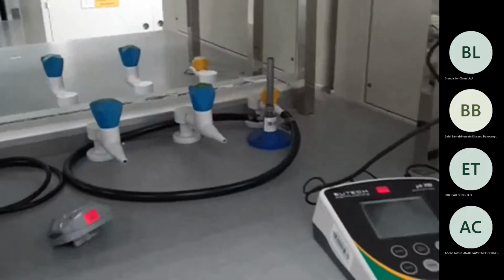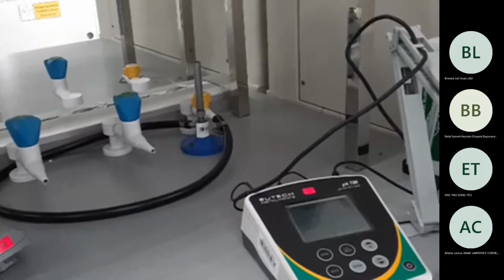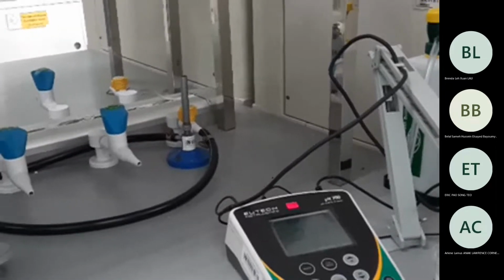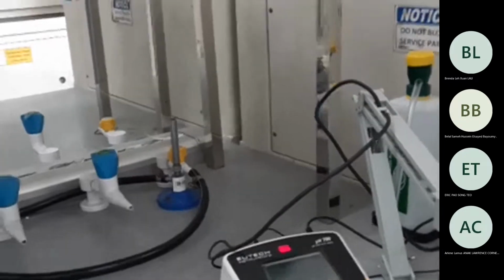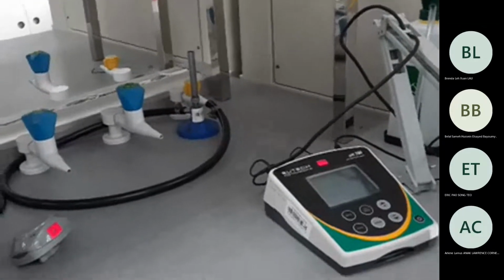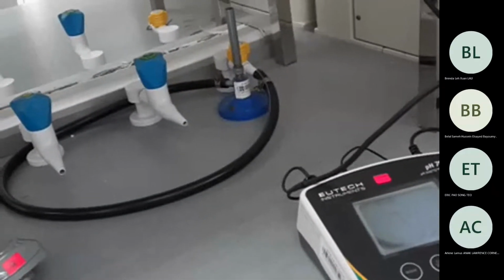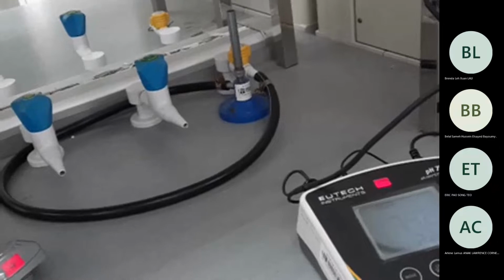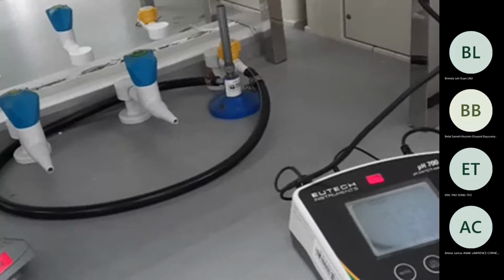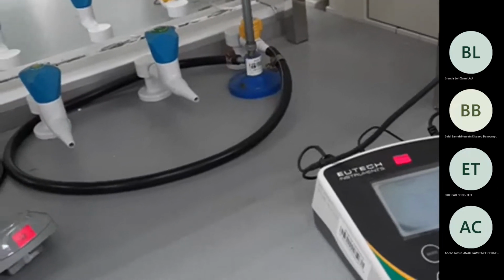Oh, so for your distilled water 5.85, tap water is getting ready. It's increasing very slowly, only 0.01 at a time. So should be fast. Is it that the cap is touching the water? The cap shouldn't touch. Lift the cap a bit up so that it does not touch here. Okay.